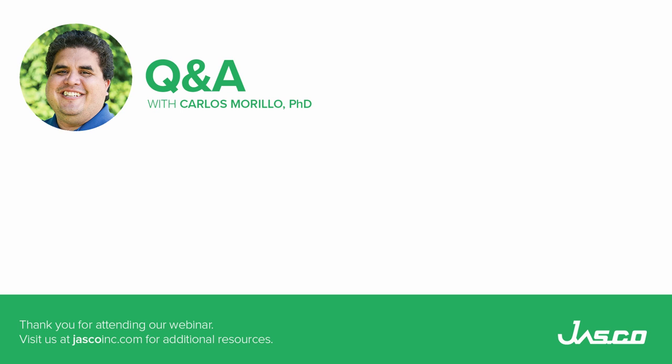I have a question. The first question is, can the SSI create images like AFM? Well, you know that AFM and Raman are totally different principles. They can be combined, but remember the AFM uses a cantilever tip that is hovering over the surface, and actually the Raman is collecting the data. But yes, what the SSI is doing is creating an all-in-focus image, and then measuring each point at each specific coordinate.